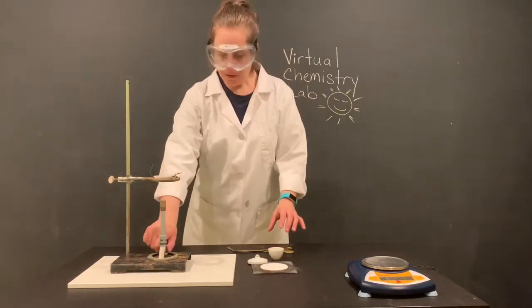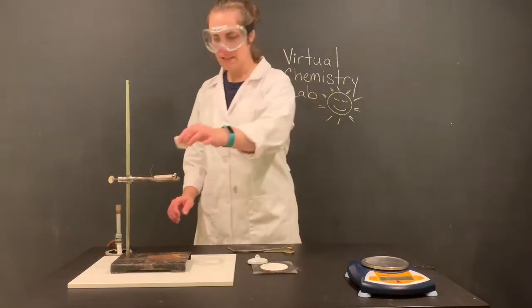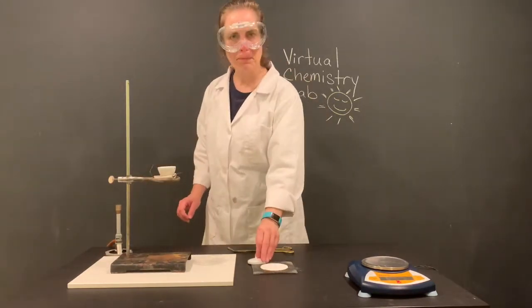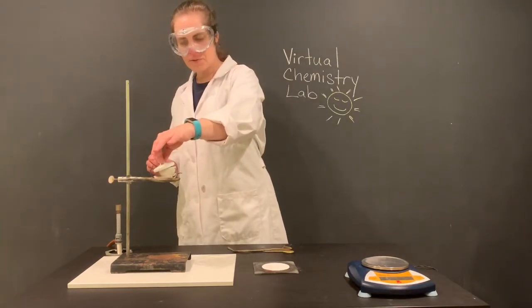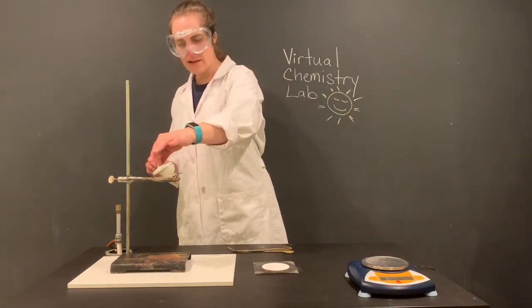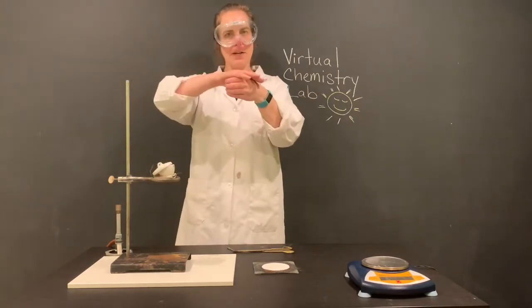Now we're going to move the Bunsen burner away, and we're going to place our crucible with our mixture in it, and we're going to place our crucible top on it. Now notice we didn't take the initial mass with the top, and that's because these tops tend to fall off, because we don't put them on straight, we leave them ajar.